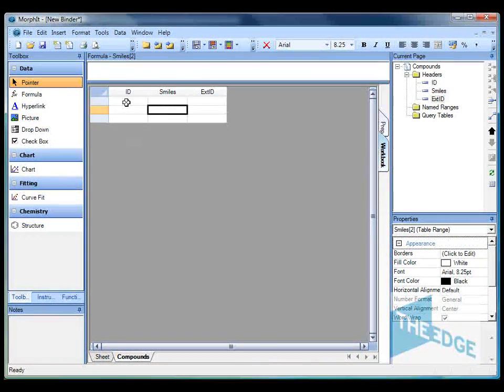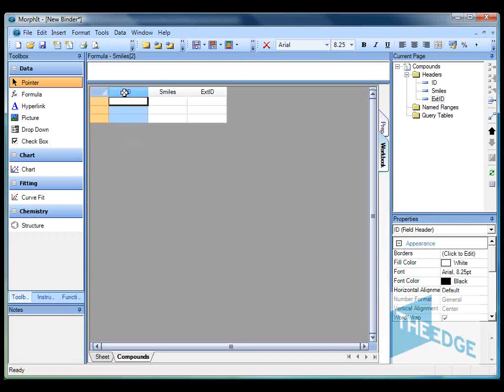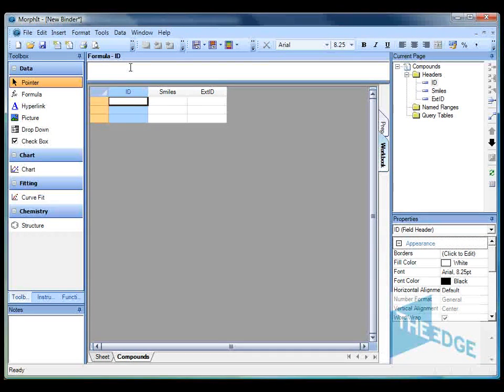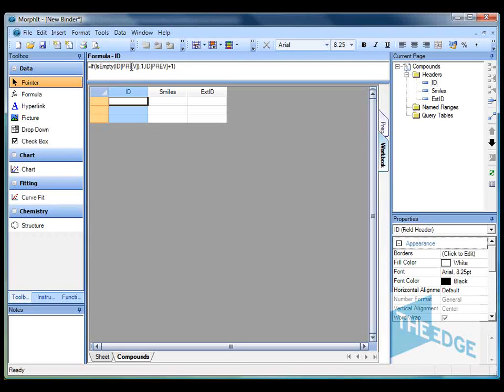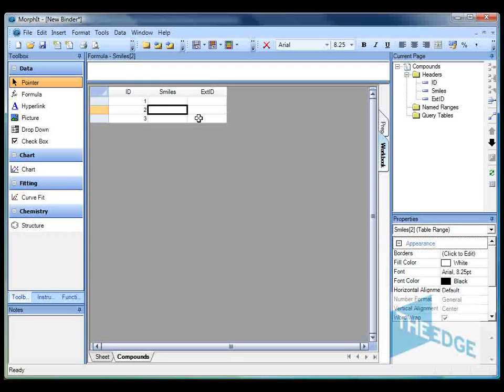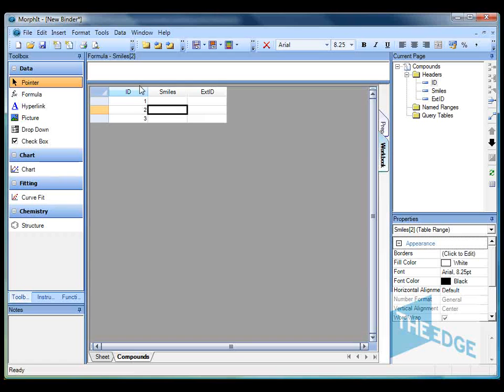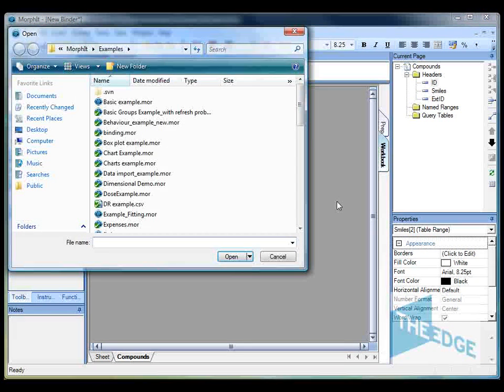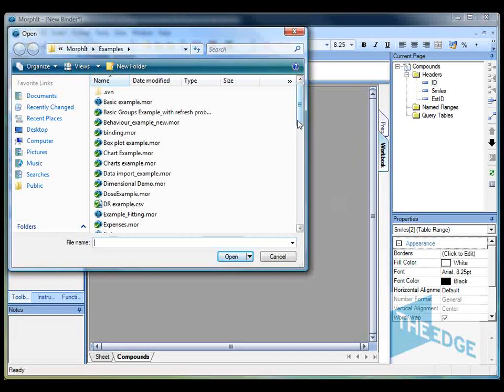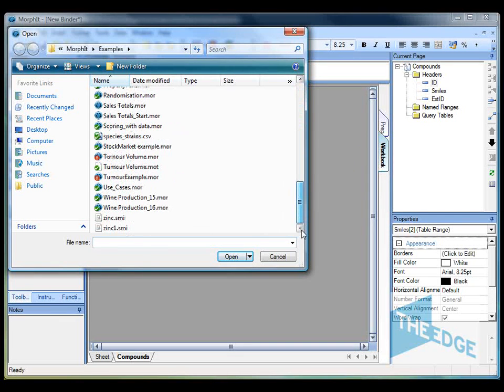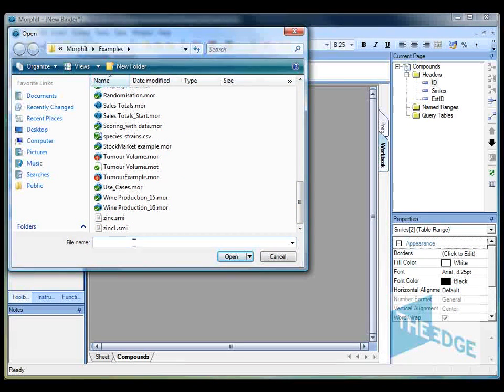First of all let's add the numeric identifier which we'll do using a formula. Now what I'm going to do is use the data import plugin in order to bring in my chemical information. So under the data menu I select the import data item. I'm then going to browse for a file which I downloaded from the Zinc database.